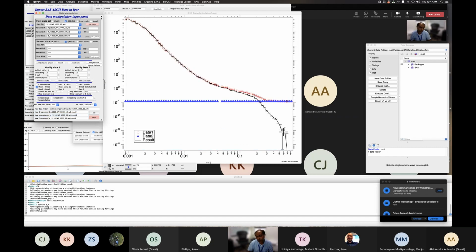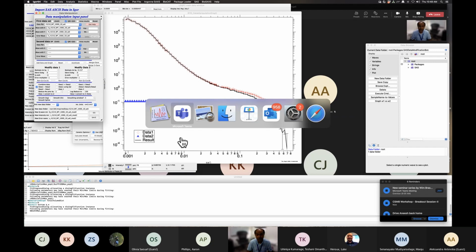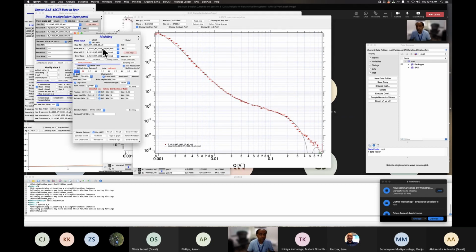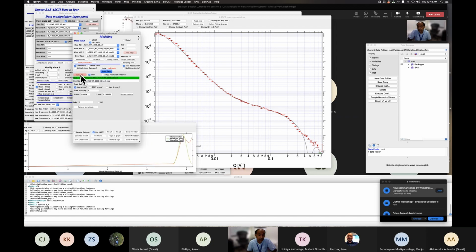You see, now we have a much more subtracted curve. A few of these final points have disappeared, but it could become in the negative direction, but that's okay. No, I don't need to change that. I come back here, and now we can try fitting different ones, right? So we need to get out, go to some other folder, come back to this folder, and then you will see these mod 1, mod 2. Mod 1 is when we subtract with isotropic.